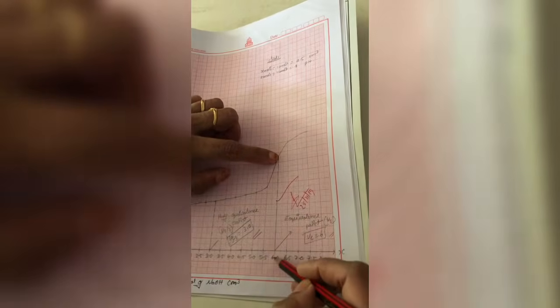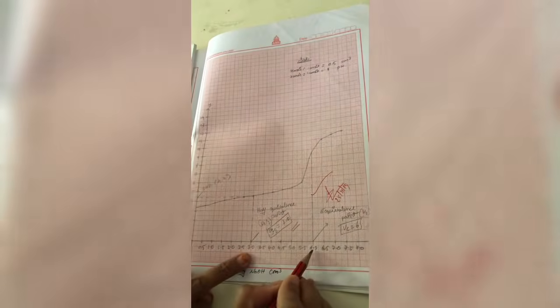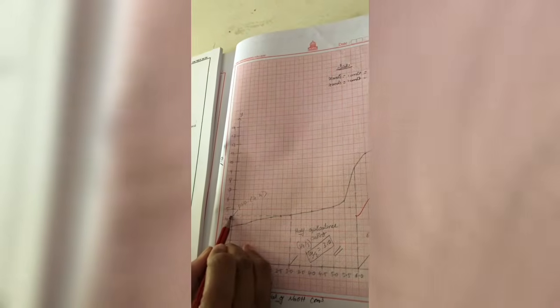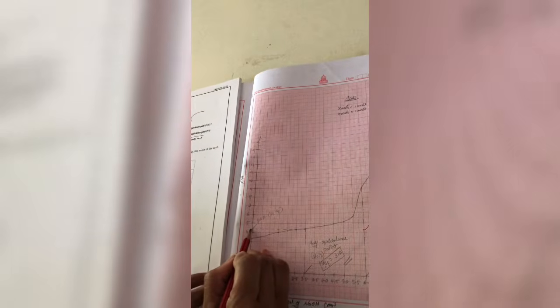So exactly at the equivalence point 6, in the S-shaped graph, you draw a straight line onto the x-axis. Half of that equivalence point, exactly half of 6, is 3. So at 3, you draw a straight line onto the graph and one more straight line onto the y-axis. Please follow: the equivalence point is 6, half of the equivalence point is 3. At 3, you draw a straight line onto the graph, and one more straight line onto the y-axis.